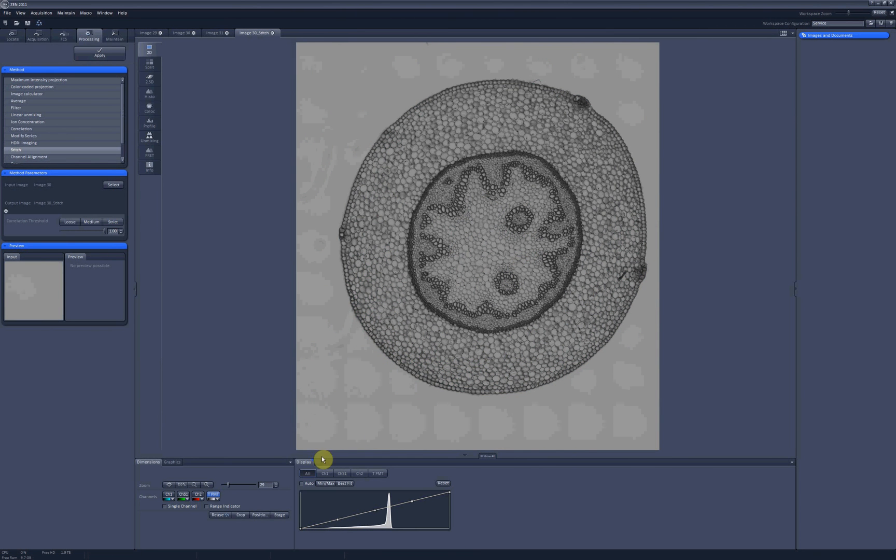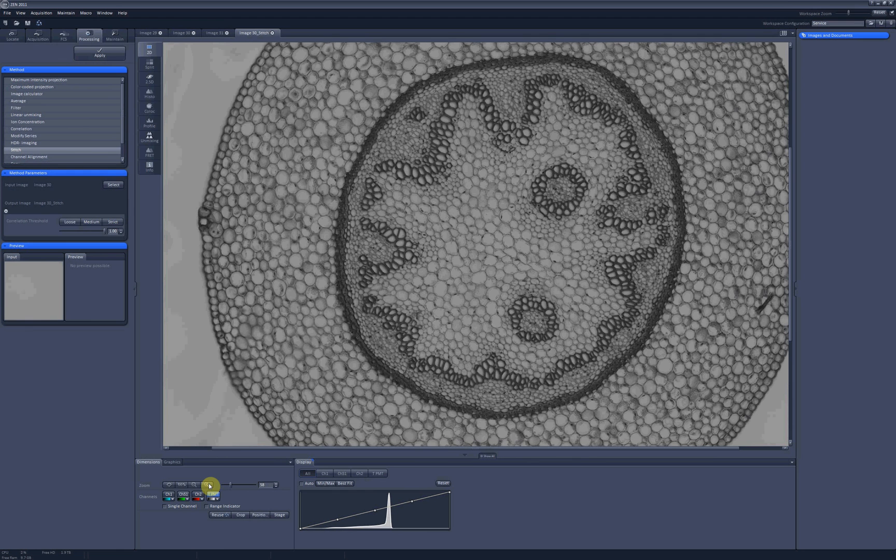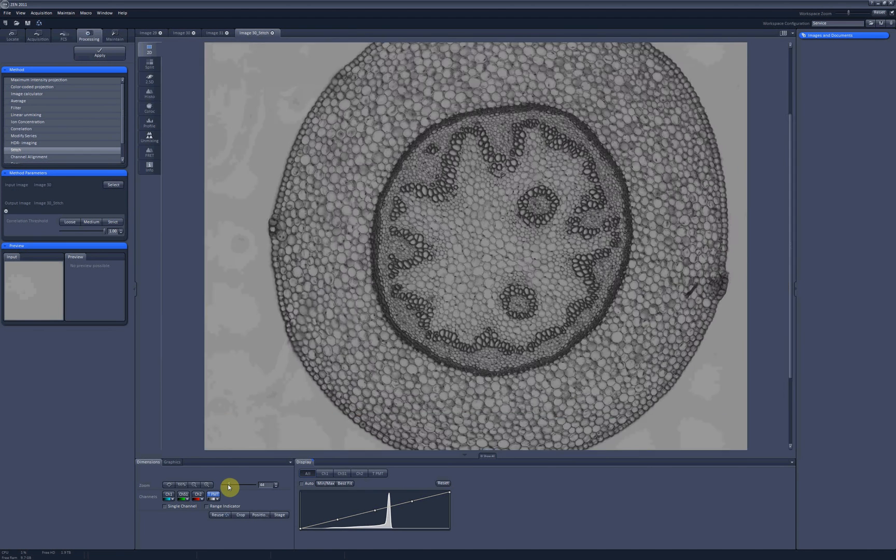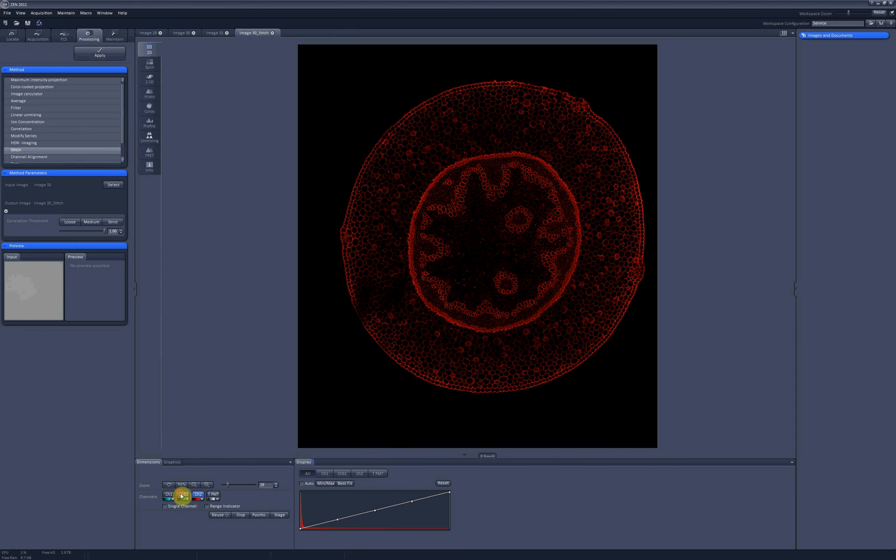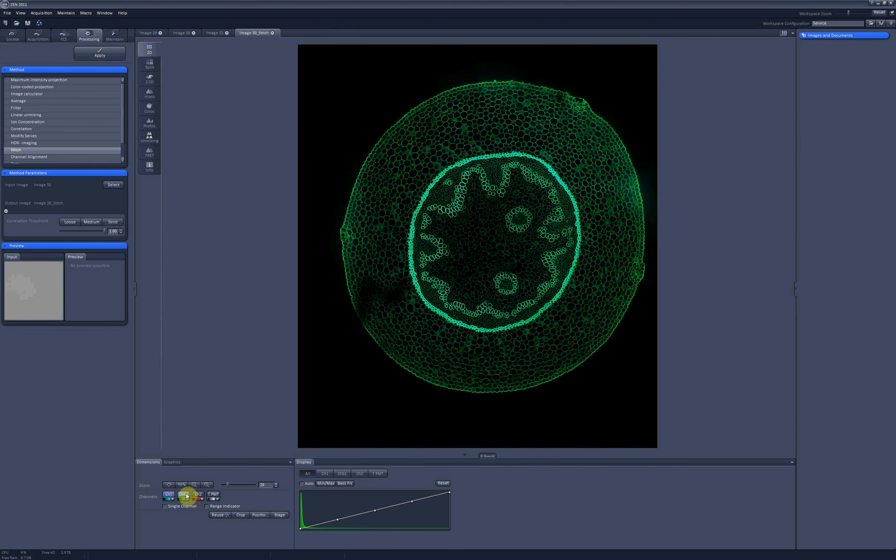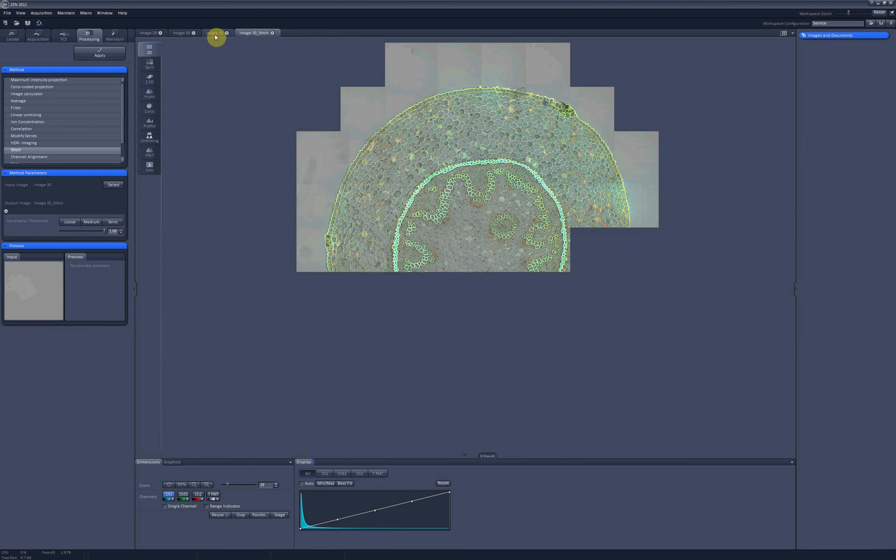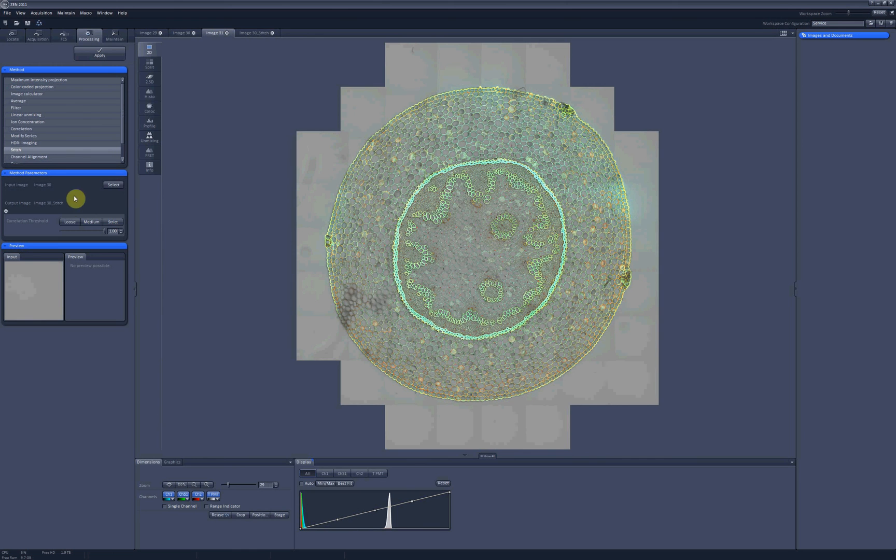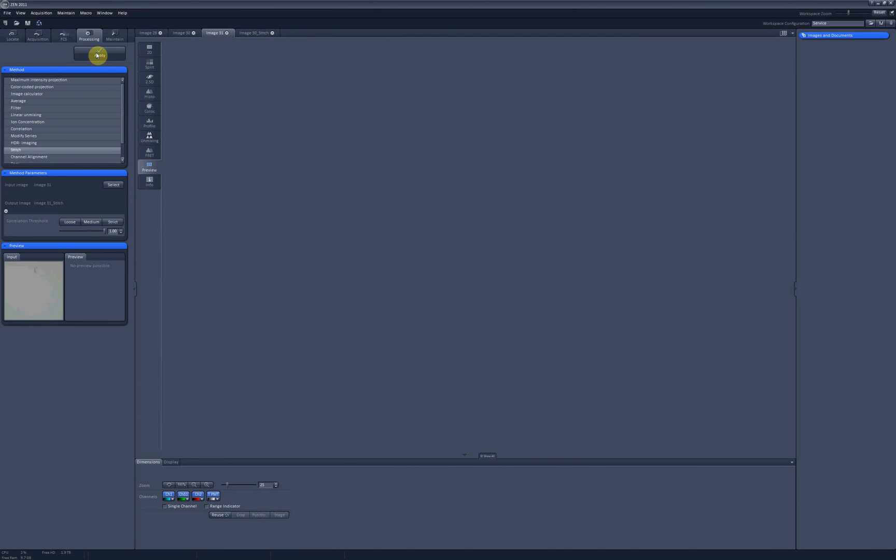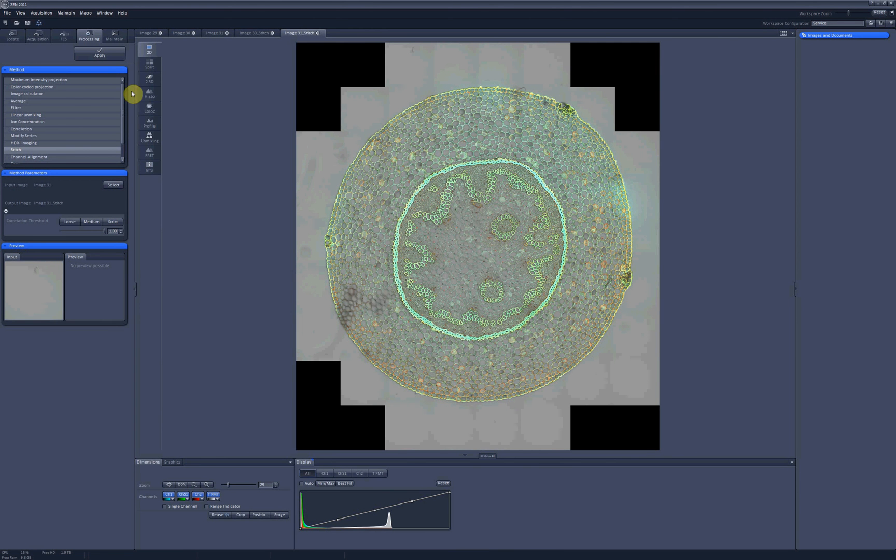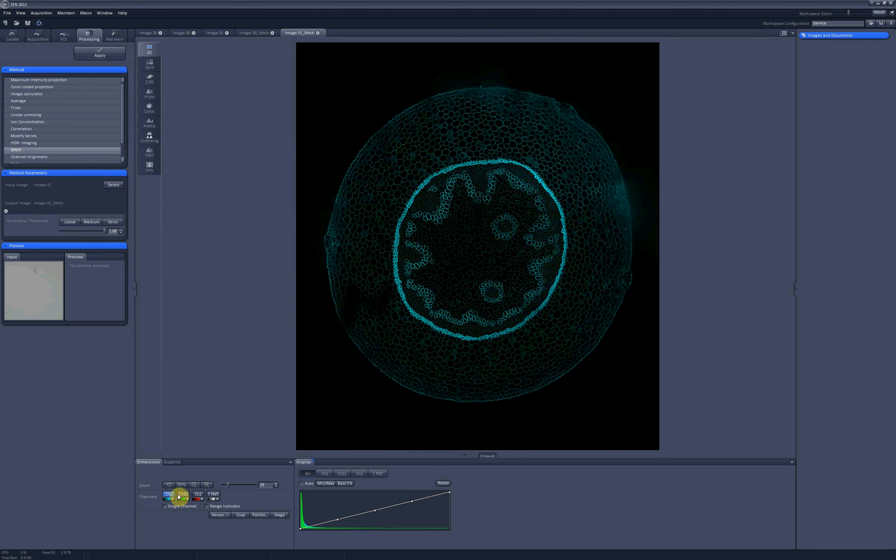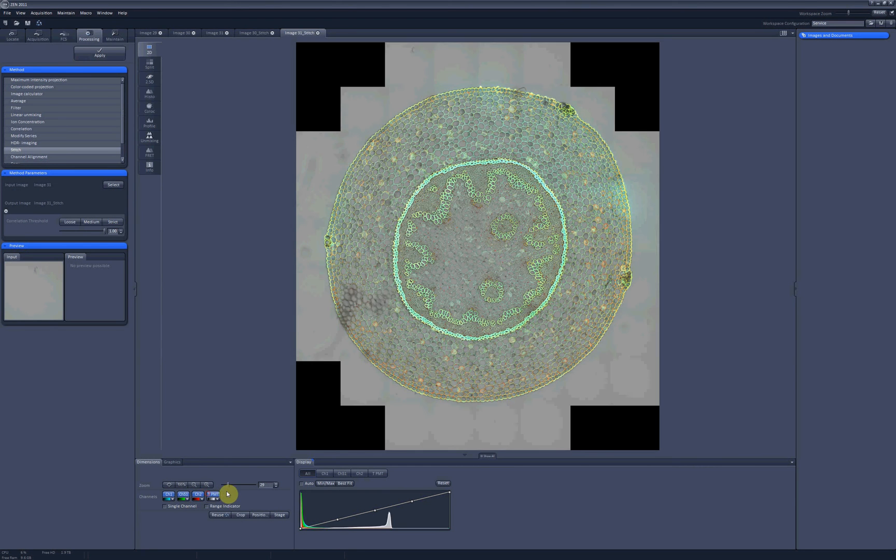And as you can see, the image now is much smoother. Actually it's difficult to believe that it wasn't imaged in just one go. And we can do the same for the convex hull. Apply. There we go.